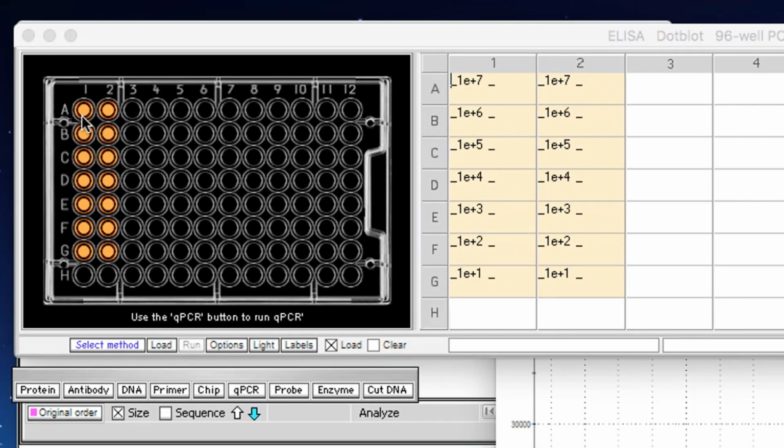You'll notice there is a replicate for each one of these. And if you look at the labels, the label indicates the initial copies of DNA present, the known initial copies present. So this is set up deliberately so we know the DNA so that we can generate a curve that can be used for predictive purposes.